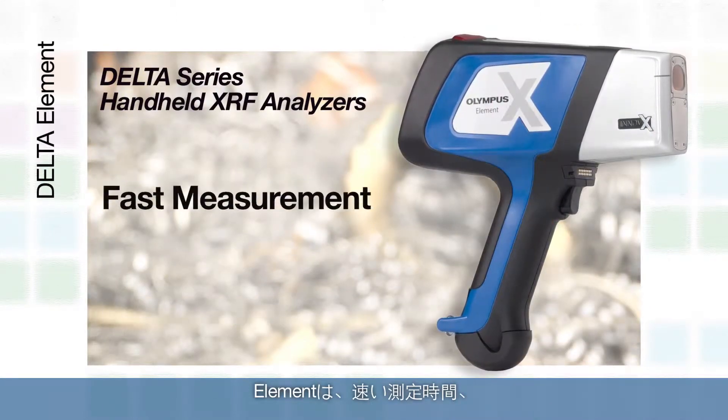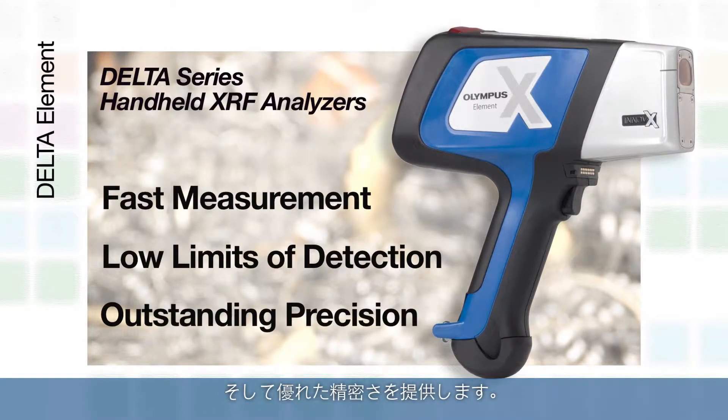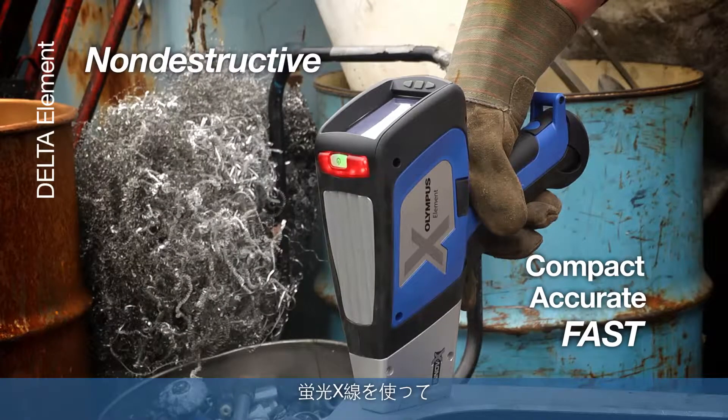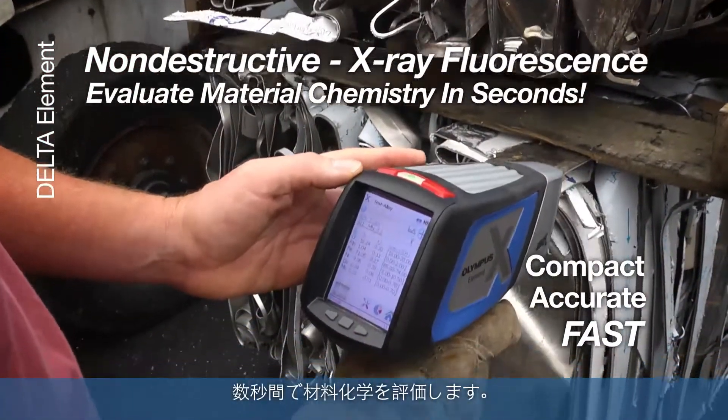The Element offers fast measurement, low limits of detection, and outstanding precision. The Delta Element's compact, accurate, and fast testing is completely non-destructive, as it uses X-ray fluorescence to evaluate material chemistry in seconds.